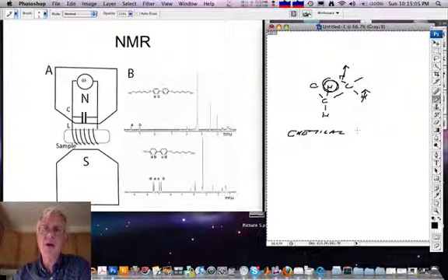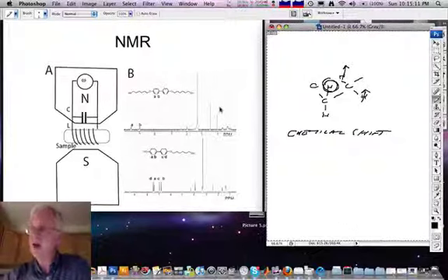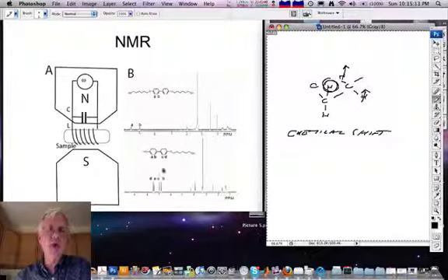So these plots here are plots of the chemical shift in a given field, and the example on this slide is for two compounds, one the desired compound, another in which the reaction hadn't proceeded fully. And you see that protons associated with these rings here are in equivalent environments in the symmetrical molecule, and so one has just two peaks representing protons here and here.